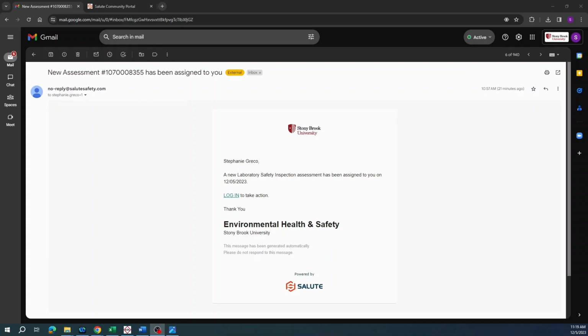Welcome to the Environmental Health and Safety how-to video for laboratory safety inspections. This video is here to explain how to read your lab safety inspection as well as respond to any findings that were listed.